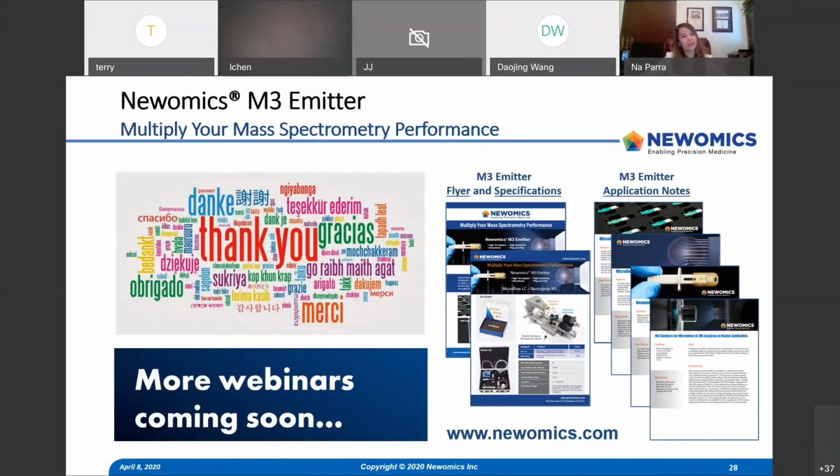Can I ask a question online? Yes, go ahead. Hi, it's a very good talk. This is Lindsay from Boehringer. I have a question. For your presentation focus on native aspect, which means your mobile phase is aqueous, so you gain about 10 times sensitivity. I'm wondering if you run in organic solvent mobile phase condition, like 50-50, for example, do you see enhanced sensitivity increase or decreased sensitivity increase? That's the general question.